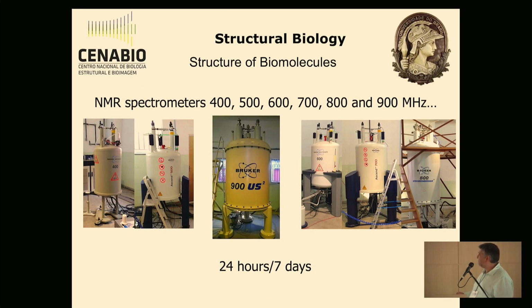And we have first one structural biology unit with several NMR spectrometers, and the last one was this 900 spectrometer, and all of these are working 24/7 every day, and are open for all people around Brazil, but not only Brazil, also from South America. Several people came to Rio de Janeiro to use this kind of equipment.